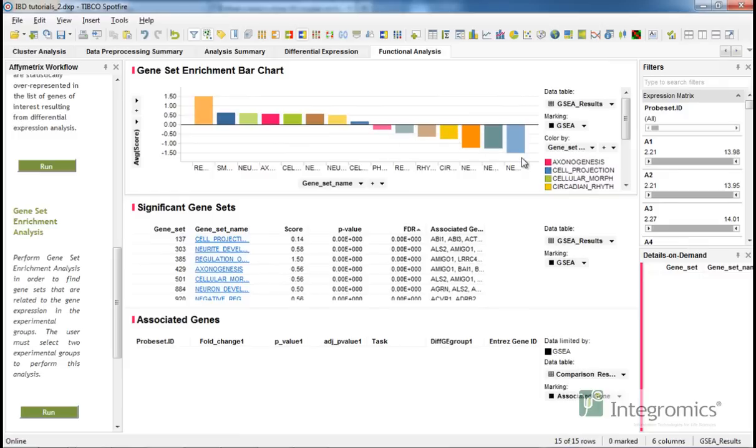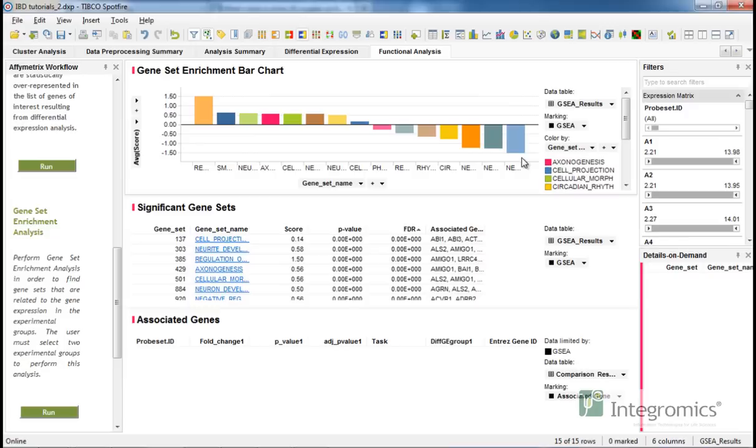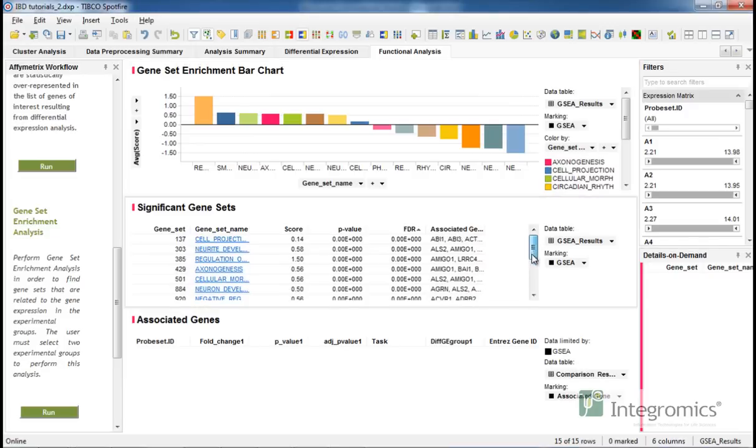The absolute value of this score indicates the strength of association of the aggregated gene expression in this geneset, while the sign indicates whether the expression is higher in target (positive) or control (negative). All visualizations are summarized in the Significant Gene Sets table.